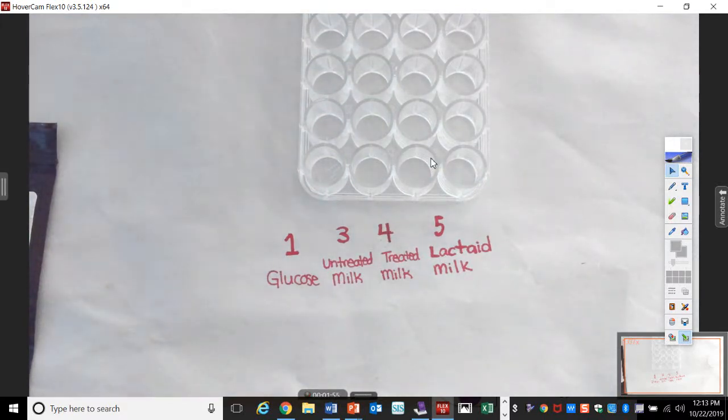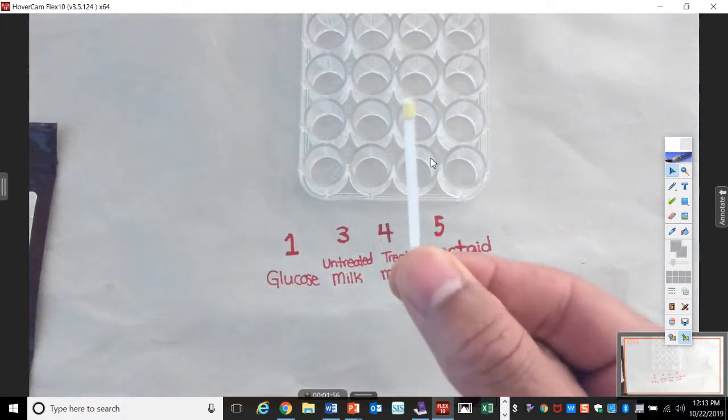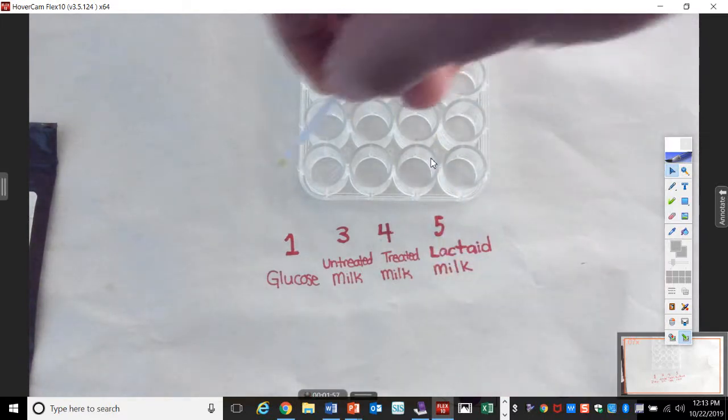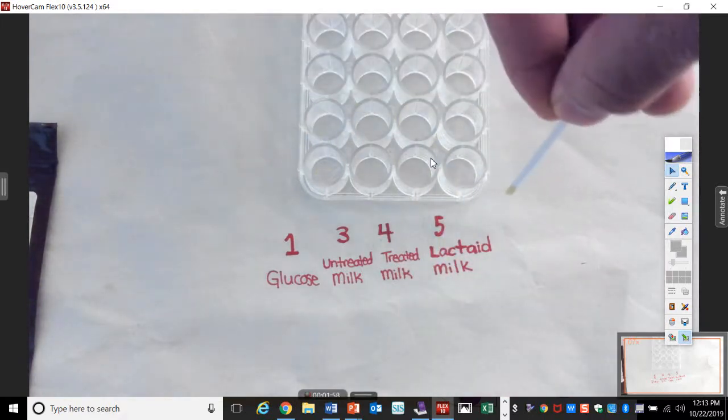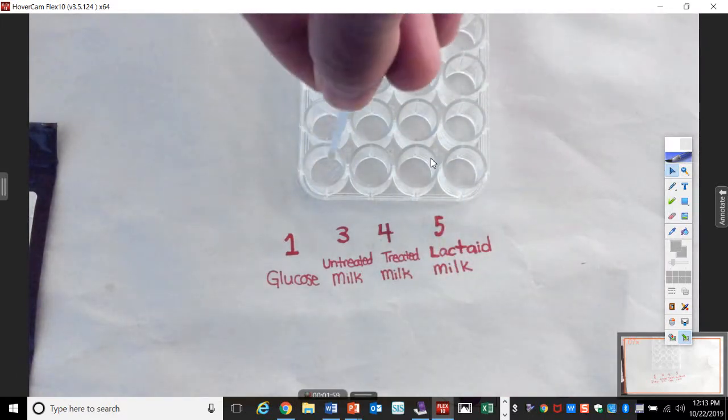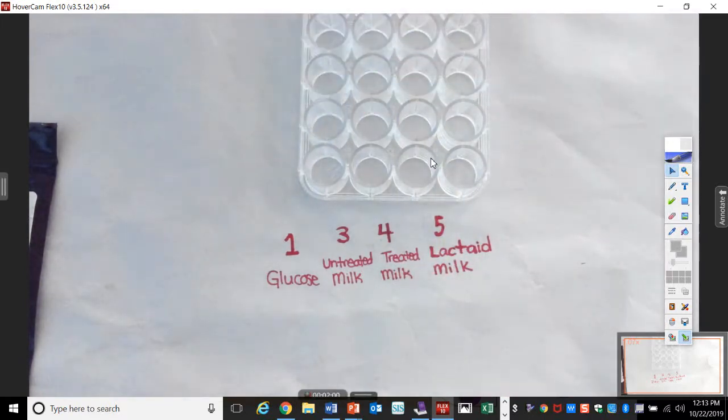And that's the strip. This is what the strip looks like. So when we're done, we'll have like four of these wells with a strip right there.